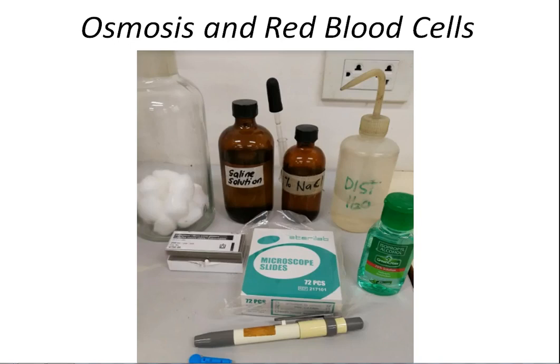So, basically, when performing this setup, we will need 3 microscopes, and then we will prepare 3 clean, dry slides and 3 cover slips. Then label each slide: one with 0.9% sodium chloride, the other slide as distilled water, and the third slide as 5% sodium chloride. Make sure to label them because all of this would look the same to the naked eye.